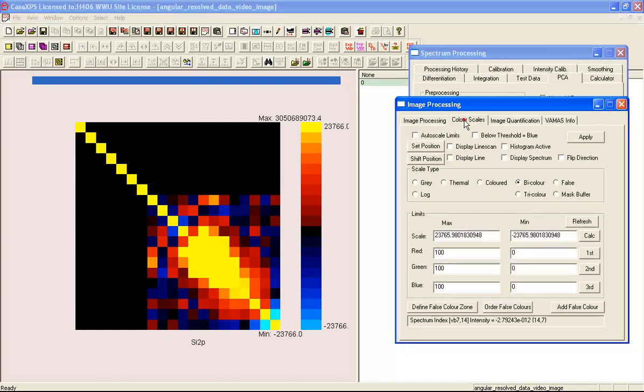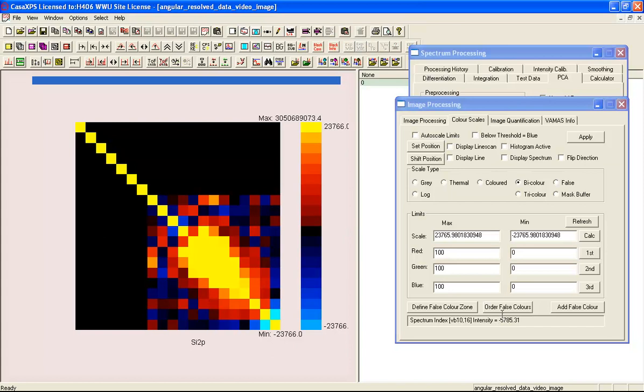So if I go to the color scale and click here, you can see that the dot product of any of the vectors lower down, so any of the 14 vectors that are not part of the 6 that have been calculated, potentially have large off-diagonal values for the covariance matrix, and this shows that they have not been fully diagonalized as a singular value decomposition.